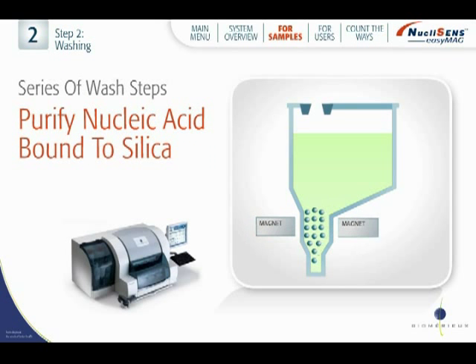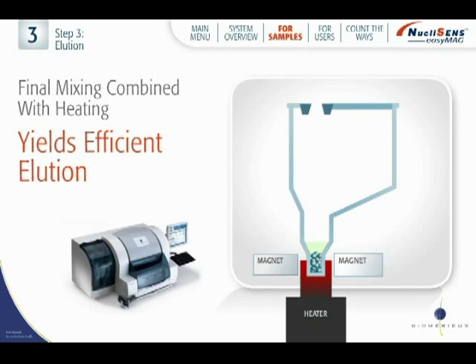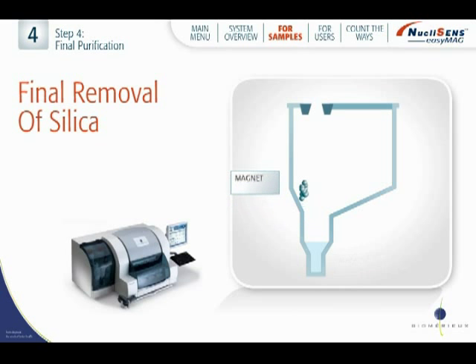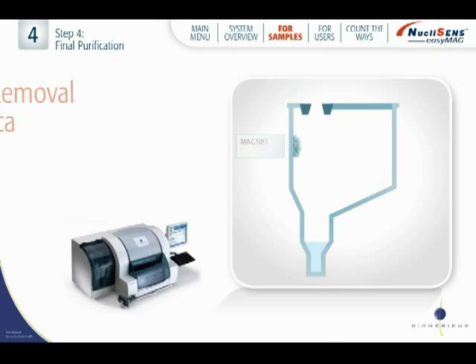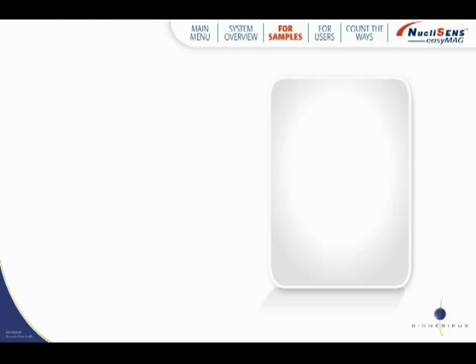Next, a series of wash steps purifies the nucleic acid bound to the silica, using a sequence of wash buffers and the lateral magnet arrays. Then the silica and final buffer are heated, resulting in efficient elution. Once the silica is removed, what remains is an eluate with pure concentrated nucleic acid ready for downstream use.